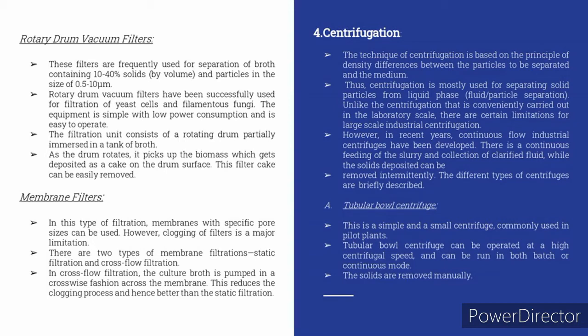In static filtration, the broth is directly pumped onto the surface which will be filtered, whereas in cross flow filtration, the broth is pumped in a crosswise fashion across the membrane. This will reduce the clogging process and is hence better than the static filtration.